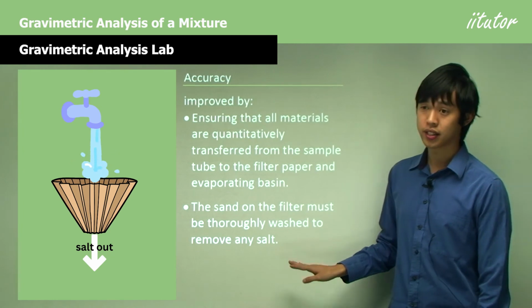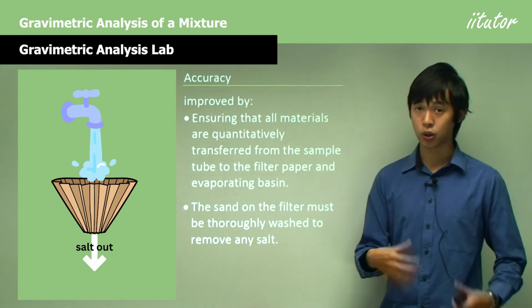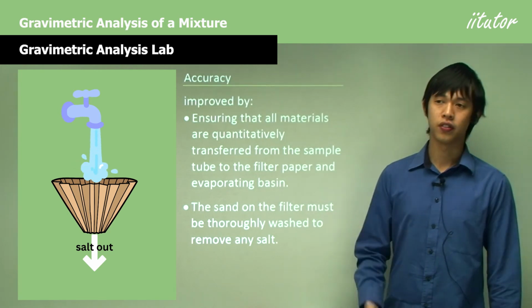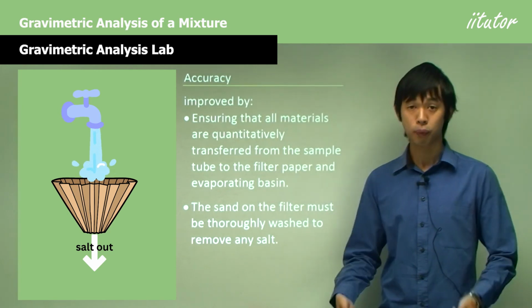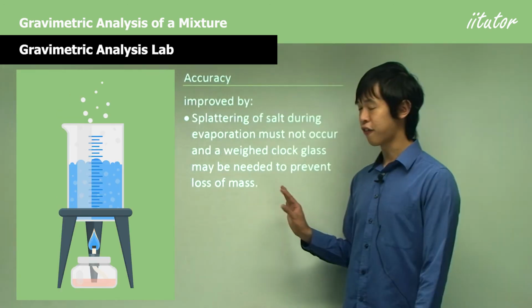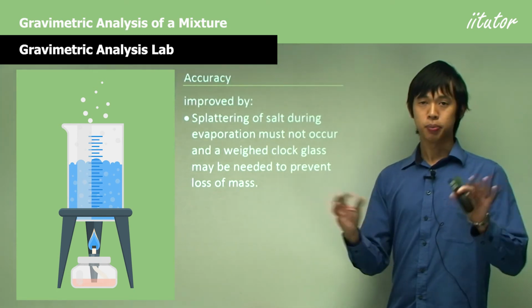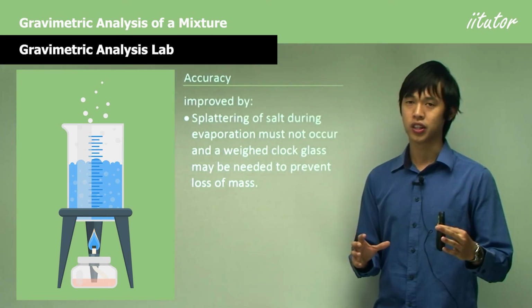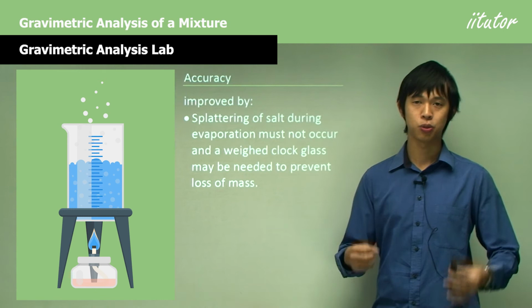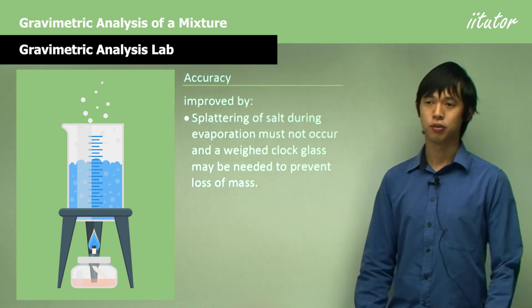The other one is that we have to make sure that we wash the sand well. The sand can hold some salt. We want to make sure we get rid of all of that. So a lazy wash will give you bad results, but if you're thorough with the washing, you'll get generally really good results. For the salt, when we heated the salt water to try and get rid of all the water, don't let it splatter. Heat it gently, and don't try to vigorously flash boil it or something. You're just trying to gently get all the water out and have the sand just in the bowl.